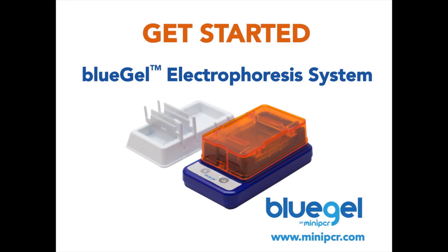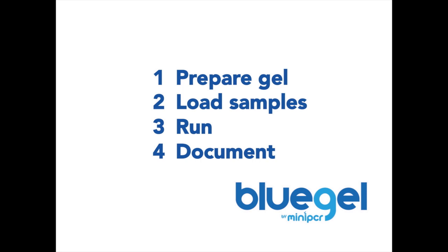In this video, you will learn how to use the Blue Gel Electrophoresis System. We will show you how to prepare, load, run, and document a gel.